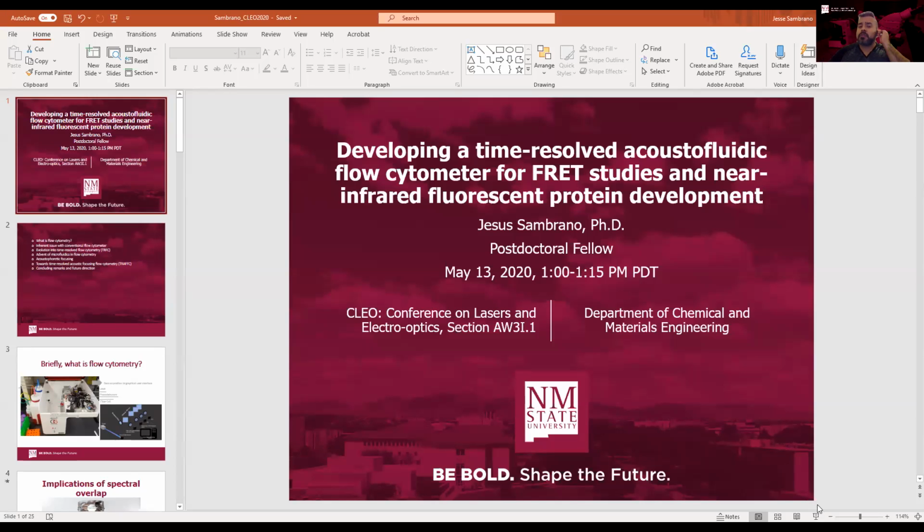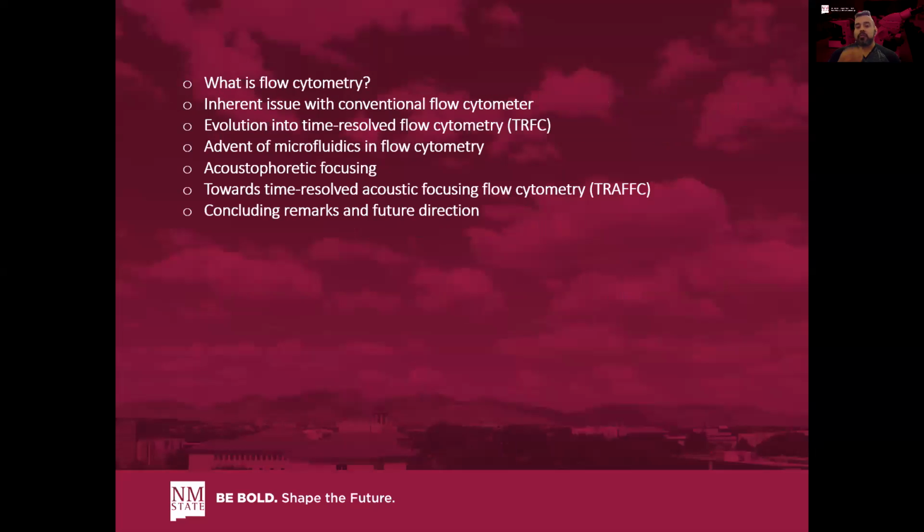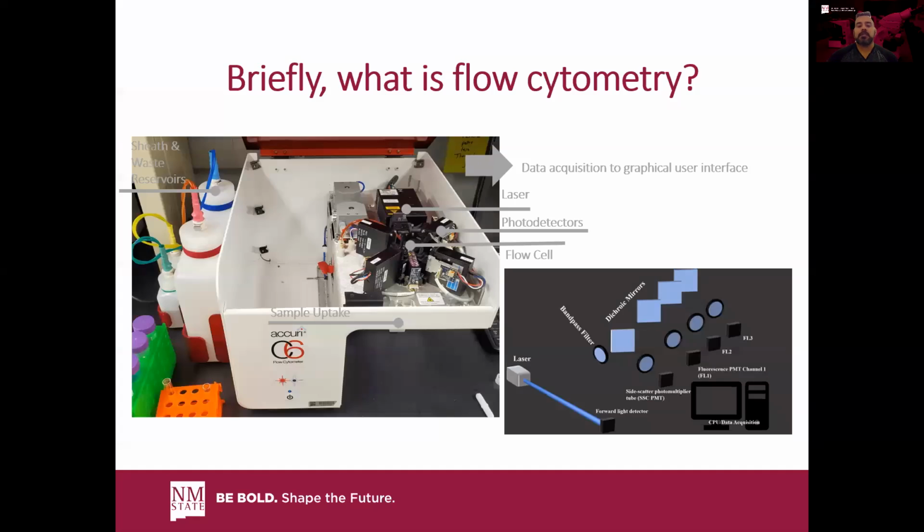Today I will be talking with you about developing a time-resolved acoustofluidic flow cytometer for future FRET and fluorescent protein development studies. So if I get started here, briefly going to go through what flow cytometry is, the inherent issues we encounter with this platform, the evolution in our lab into a time-resolved platform, and of course, incorporation of microfluidics and acoustofluidics to bring together what we have today as an acoustofluidic flow cytometer.